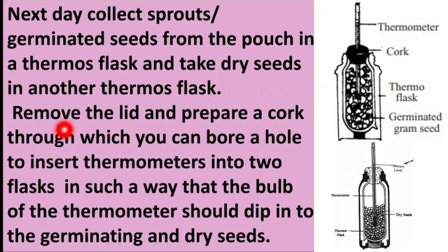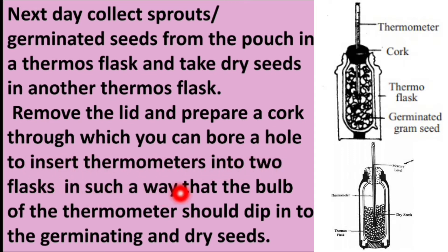Remove the lid and prepare a cork through which you can bore a hole to insert thermometers into the two flasks, in such a way that the bulb of the thermometer should dip into the germinating and dry seeds.